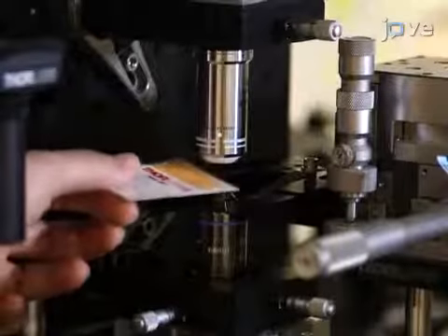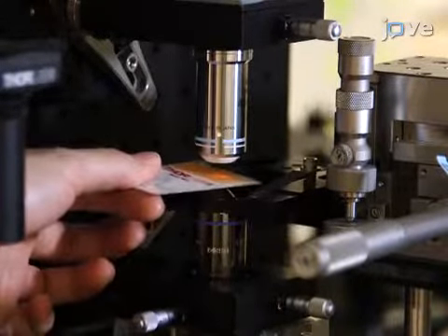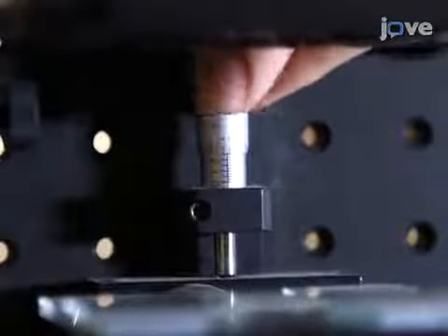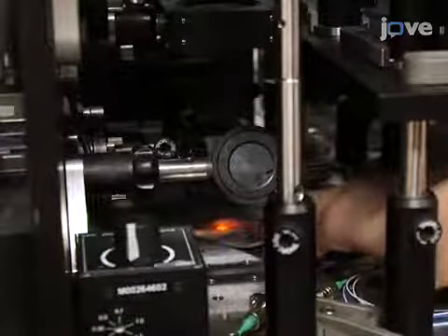Place another objective lens with a plane mirror at its rear aperture above the sample platform. Adjust the objective lenses until their focal planes overlap. Verify that the spectral shower double passes the image plane and follows the same path back.